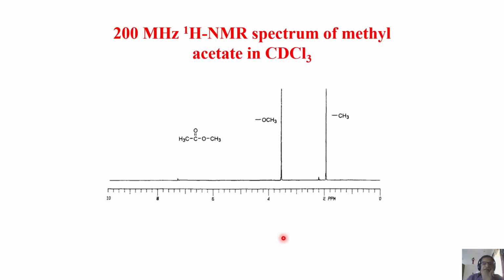And look at the peaks. I have taken an NMR spectrum like this. This is a simple molecule.